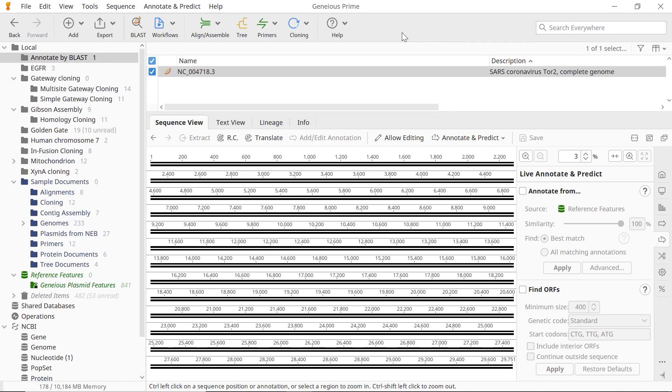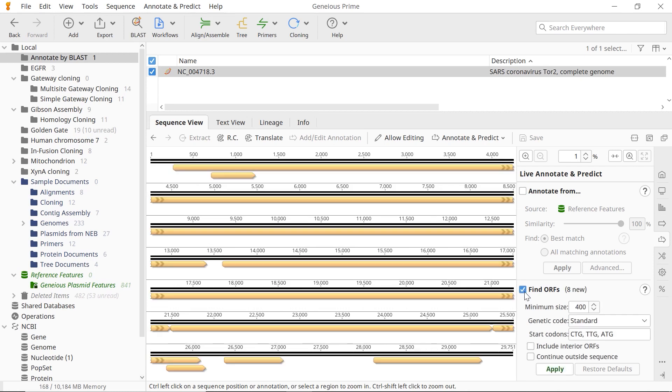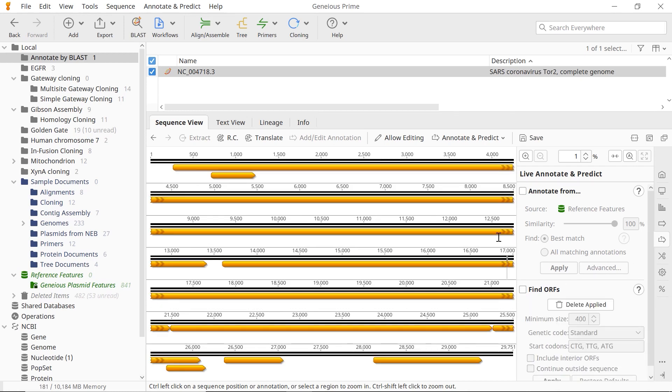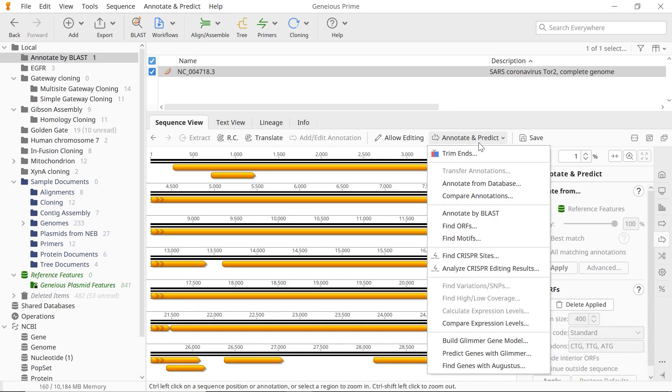Annotate your sequences with ORF using Find ORF under Annotate and Predict or via the Glimmer plugin. Alternatively, annotate with CDS or mRNA using the Augustus plugin.